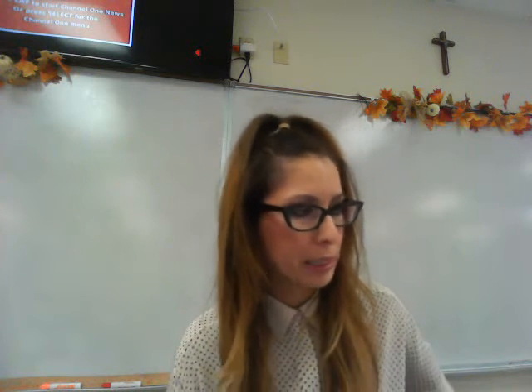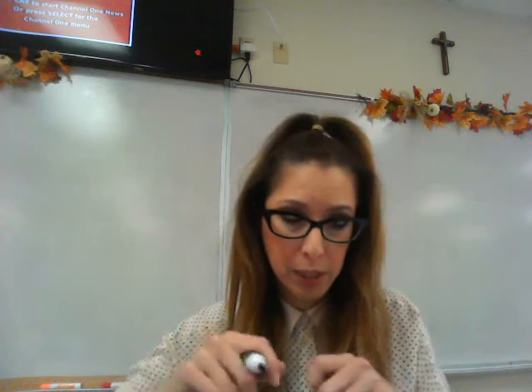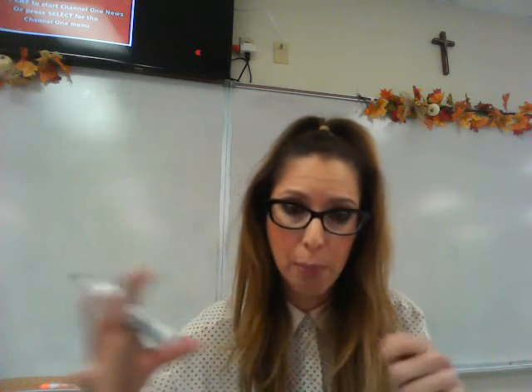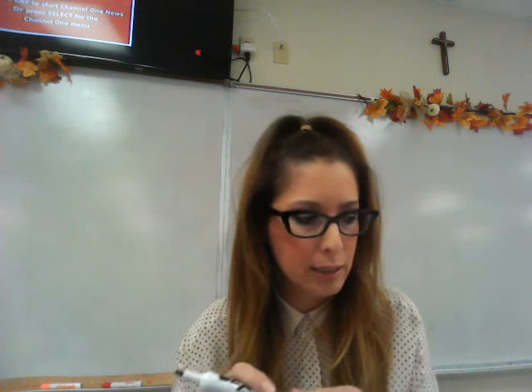Okay. Part C3, you're going to be heating a piece of copper wire. So when you have a piece of copper wire, you want to take a piece of sandpaper and rub the end of the wire with the sandpaper, okay, to make sure you have fresh copper revealed. And then you're going to take some tongs and hold the very tip of it into a flame, and you're going to observe the appearance. You don't have to hold it there for very long. The color will probably change right away.